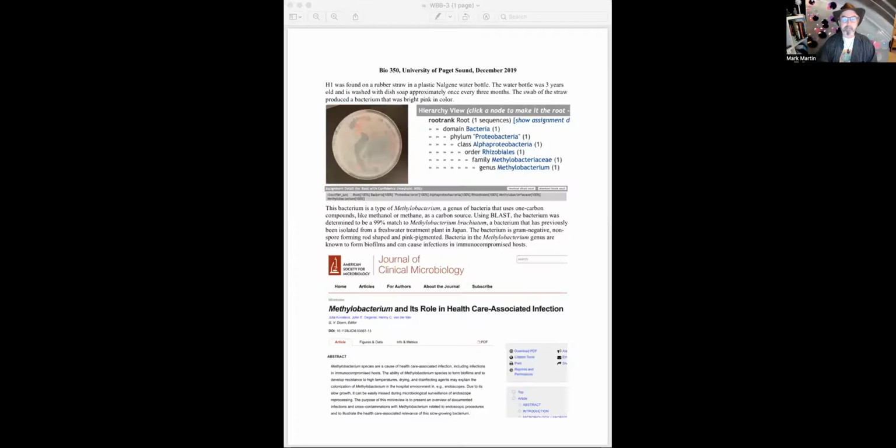In other news, I wanted to talk to you a little bit about what I would like to see when it comes to your water bottle buddy report. And keep in mind, you'll be doing this with your successful soil isolates as well. The first thing I want to show you, and I have a lot of things open, so you've got to forgive me, is that the final version is something like this. If you're looking at this image that I'm sharing, you can see the idea of a water bottle buddy. Let me pull that up a little bit so you can look at it.